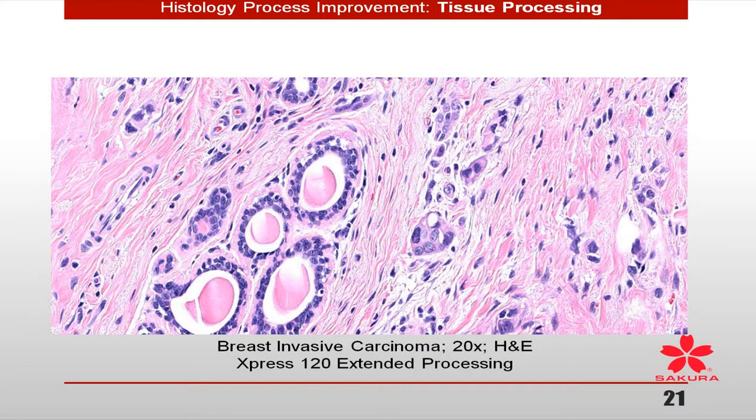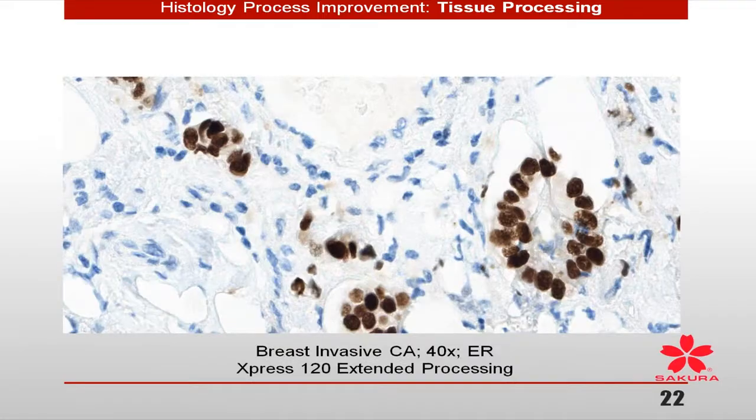There are trade-offs in moving from what I consider a standard conventional to a rapid to a continuous rapid. But if you start thinking in these different terms, I think you're going to start leading yourself to that continuous rapid process. But you can create consistent diagnostic results.